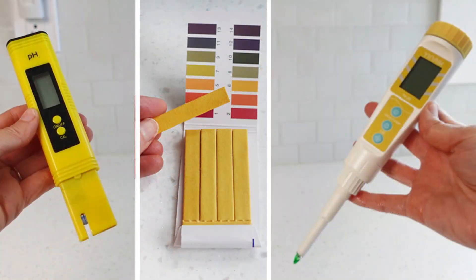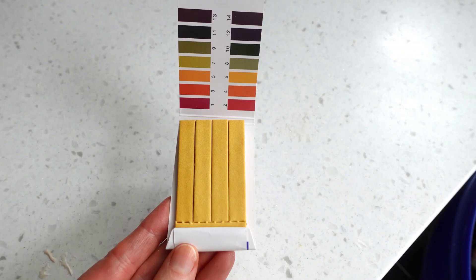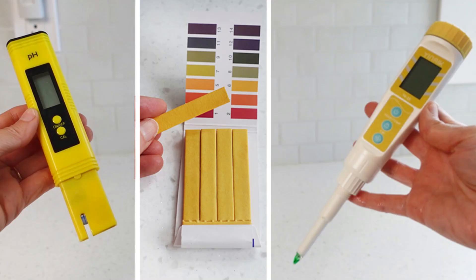In this video I'm going to compare three pH testers specifically for testing the pH of fermentations. Two are digital pH meters and one is a paper test strip. I will review their features including pros and cons of each so that you can make an informed decision on which is best for you. I own all three of these and have used each for an extended period of time, so my review is based on actual experience.